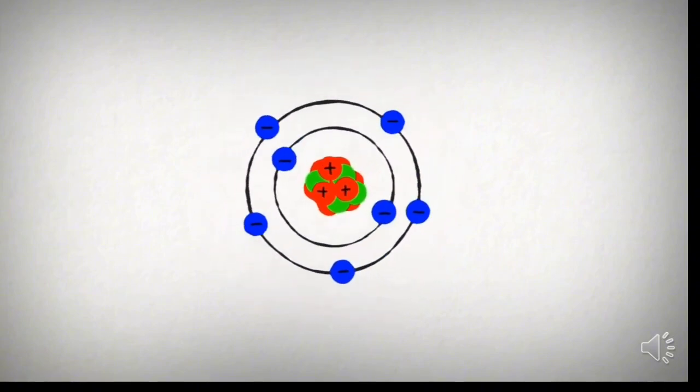This video talks about what a single crystal X-ray diffraction experiment is. A crystal is placed in the center of the instrument. The crystal is rotated in a beam of X-rays, and a two-dimensional detector records the signals from the sample, their positions and the intensity of these signals. The three-dimensional structure of the sample can be unambiguously determined.